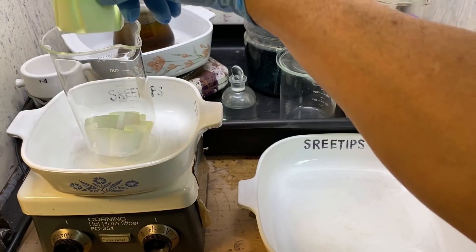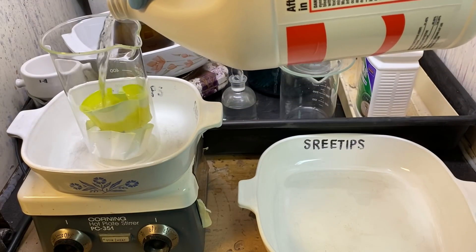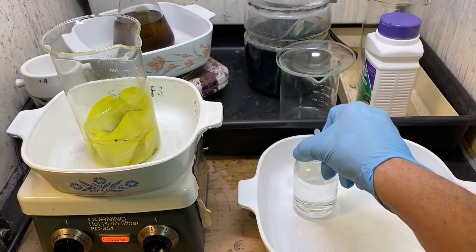Here's both of our filter papers. I'm going to add some hydrochloric acid to this, turn the stir bar on, put some heat to it, and then add some nitric acid.